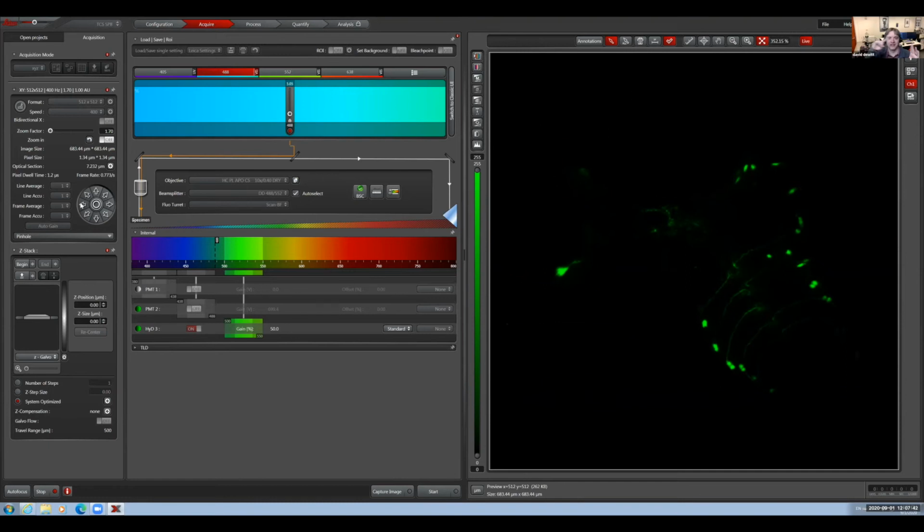But the other part of that is when you were looking at the entire field of view, you were spreading that laser power out over the entire thing. If you take that same amount of laser power, you're concentrating it into that tiny little area you zoomed in on. You can actually photo bleach much faster by zooming in. Oh, so that's the same thing as with different lenses. As soon as you go to a higher objective lens, you bleach stuff. Yep. Right. Literally focuses it. Okay. Yep. And that's what this is doing too, it's just spending more time on a smaller area, same amount of laser, it's more likely to bleach.